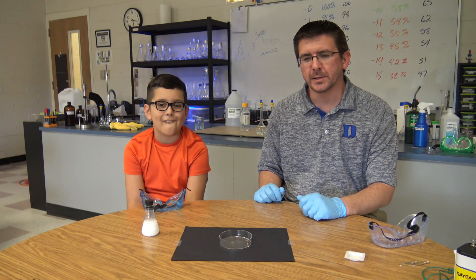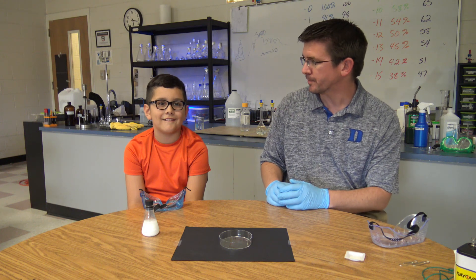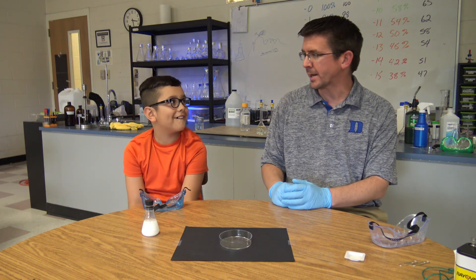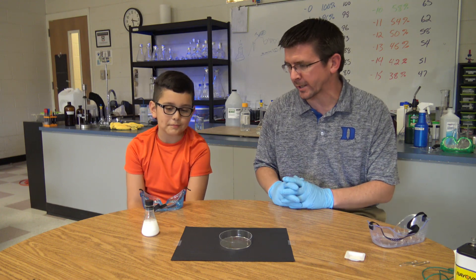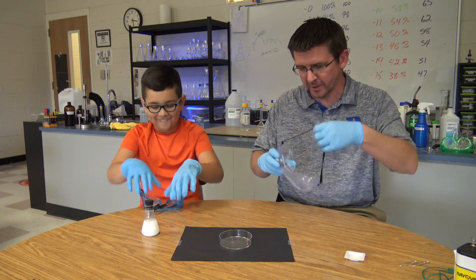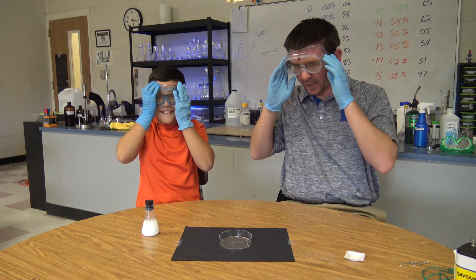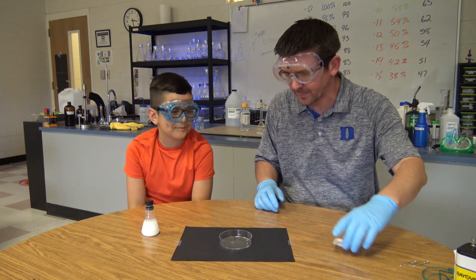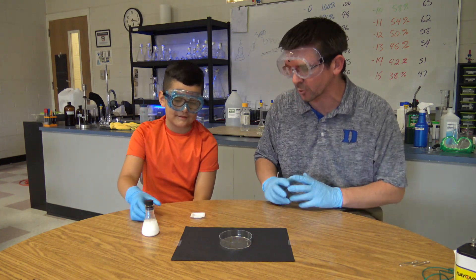I'm here with Hunter today and we're going to look at this idea of electrolysis, which is using electrical current to create or produce a chemical reaction. Hunter is going to be using tin(2) chloride for this and he's got a solution of it there. Let's go ahead and put our goggles on and then I'm going to have you add some sodium bisulfate into that. Right now it's kind of this whitish color and we want it to be clear so that we can see what's happening in it. Go ahead and add that into our tin(2) chloride.